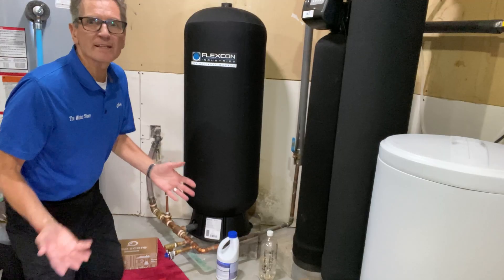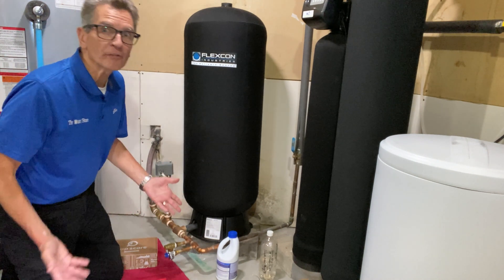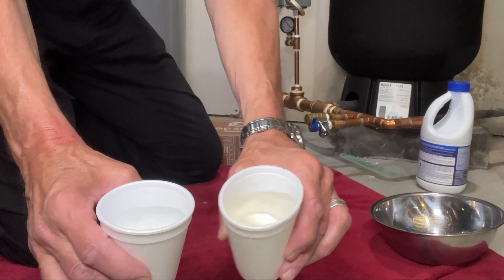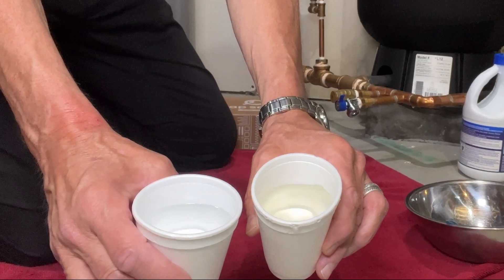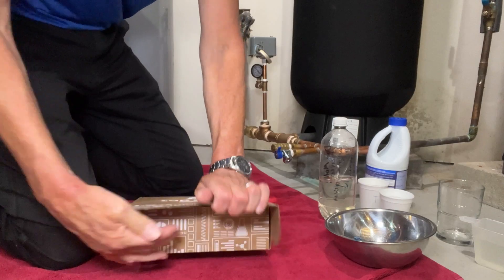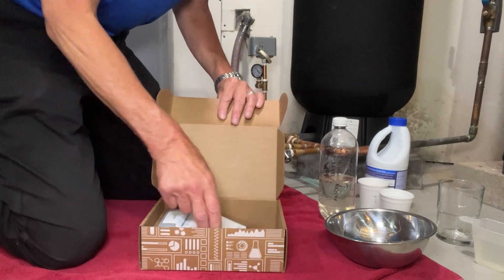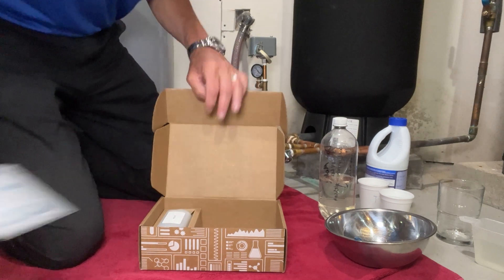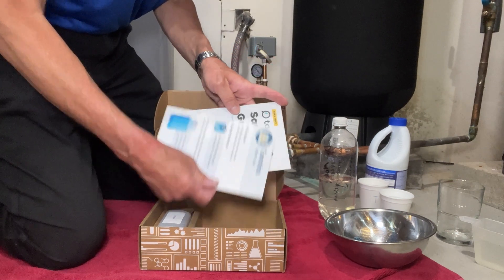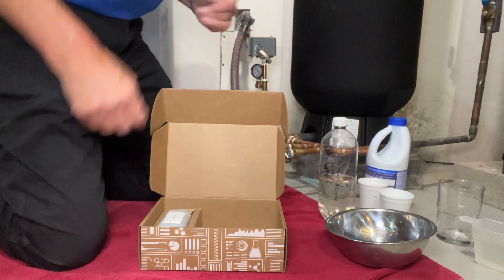Next up is the tannins test. Tannins give water a weak tea color, and you'll often find that in lake water and occasionally in well water too. You can identify it by pouring water into white cups — the tannin-affected water is darker, like a light tea color, compared to regular tap water. Inside the tannin test kit there's mailing information, forms, and a guide that explains how to do the test. This is a fully flushed test, meaning you take it after running the water for five minutes.